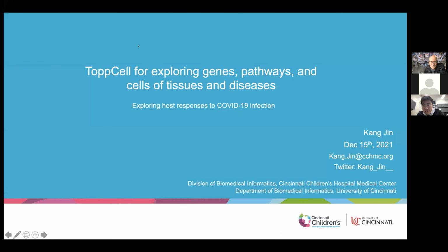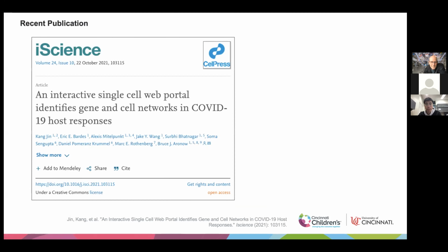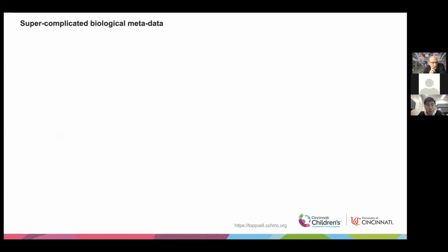So thanks everyone, and I'm Kang, a PhD student in Dr. Bruce Aronow's lab, and today I'm going to talk a little bit about how I can use ToppCell to explore the host responses in COVID-19 infection. And here is a recent paper that we just published about this tool, the web portal, and how it can be used to explore something we are interested in, COVID-19 host responses.